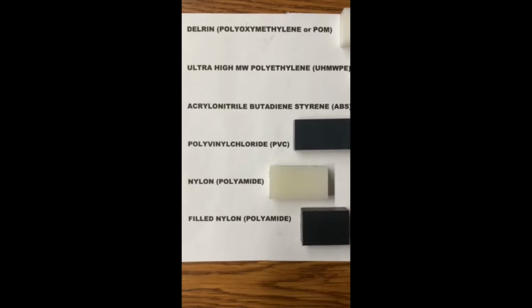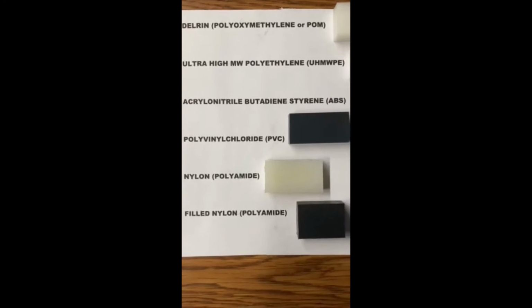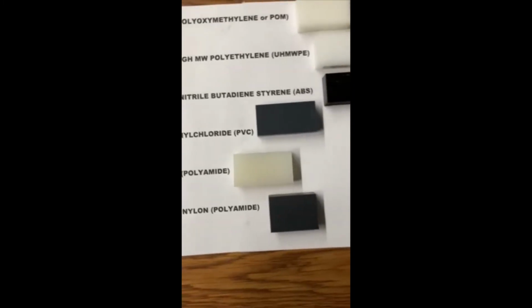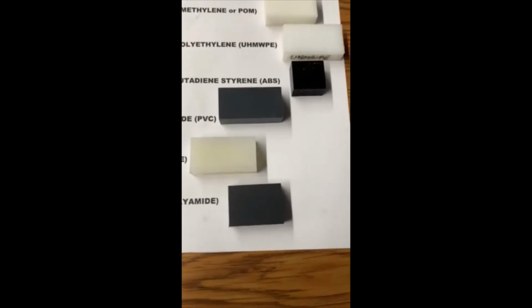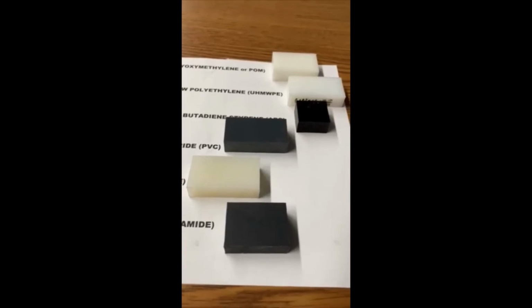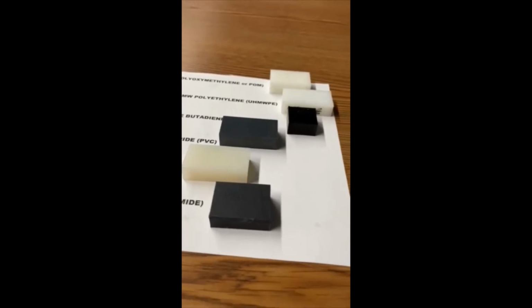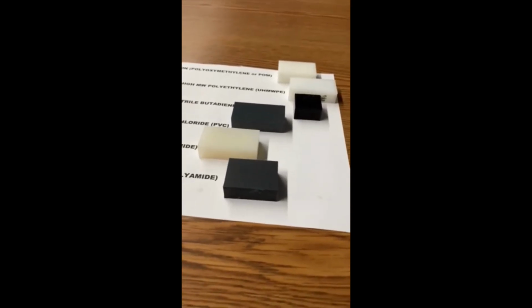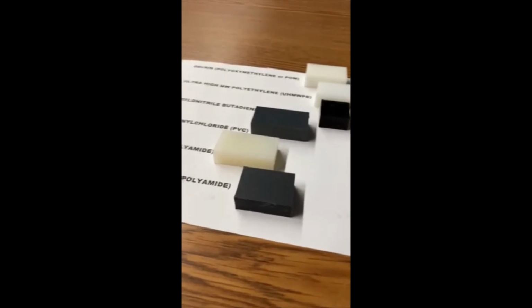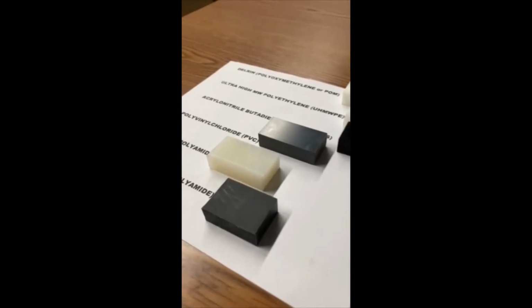We will measure the length, width, and thickness of each of the rectangular prisms, from which we will calculate the volume of the polymer samples. Or we will be measuring the diameter and length of the cylindrical rods for the metal samples. Then we will weigh the samples in a simple balance, use the mass determined from the weighing process, and calculate the volume of the sample from the dimensional measurements of the samples, and we will calculate density from those values. We will do that and repeat it for each sample, and we repeat it for the metal samples in the cylindrical form as well.